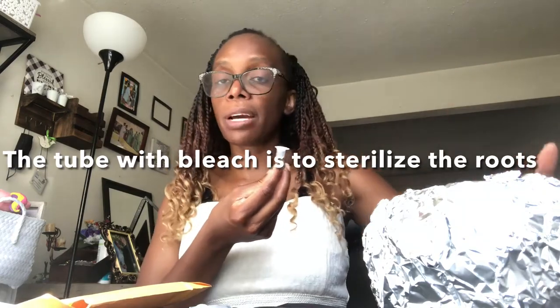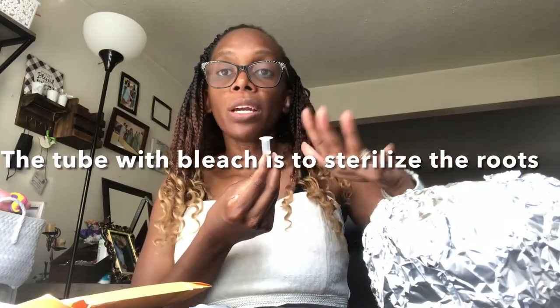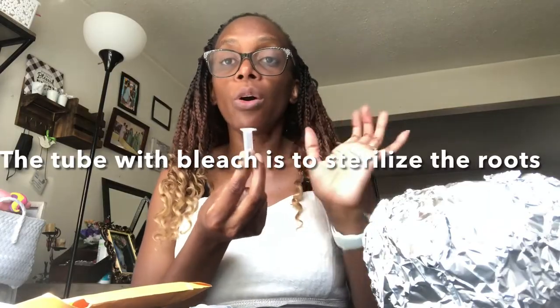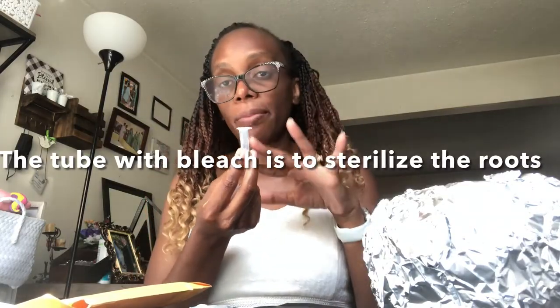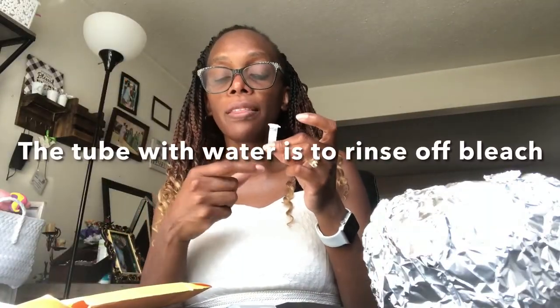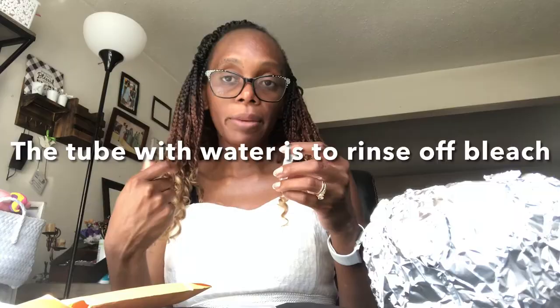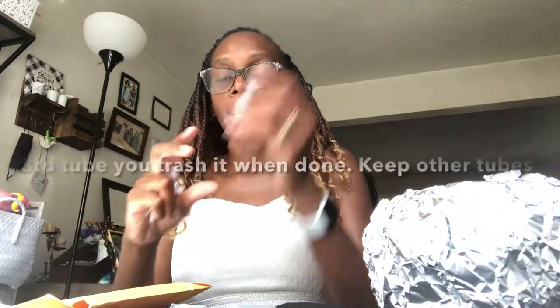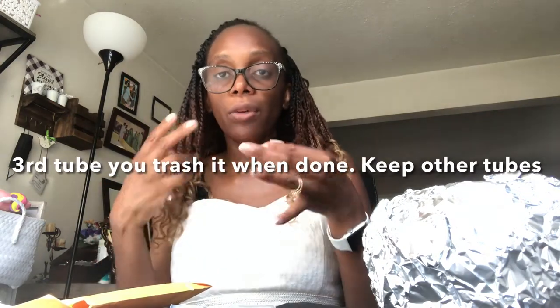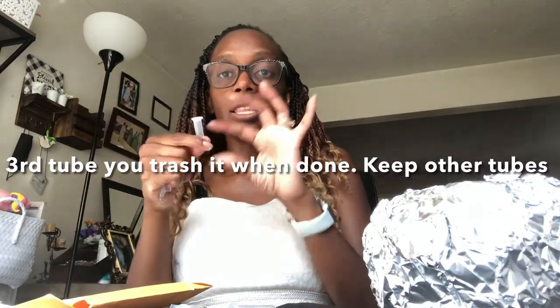The soil contains many different microorganisms, good, bad, harmless, but we are only concerned about one particular type, which we know enters the plant roots. Okay, and then we rinse off the bleach, because we don't want that bleach to eventually get to our target bacteria and then kill them. And then the third one, we crush or break open our root segments. Why is that? Because we are looking for bacteria that is inside these roots.